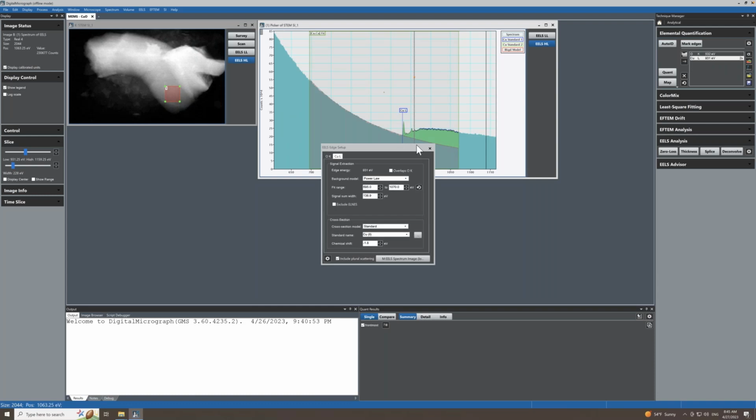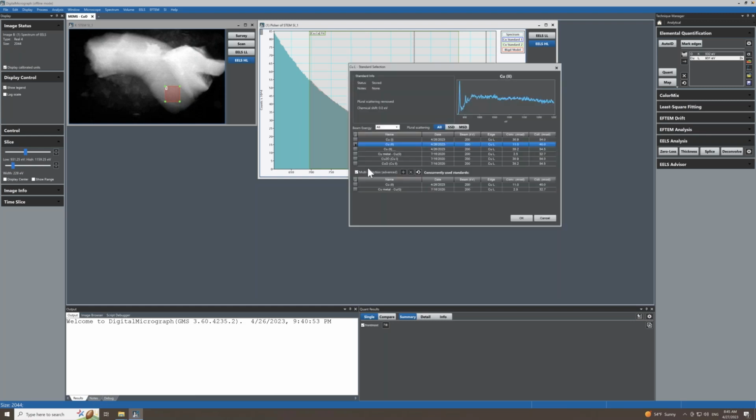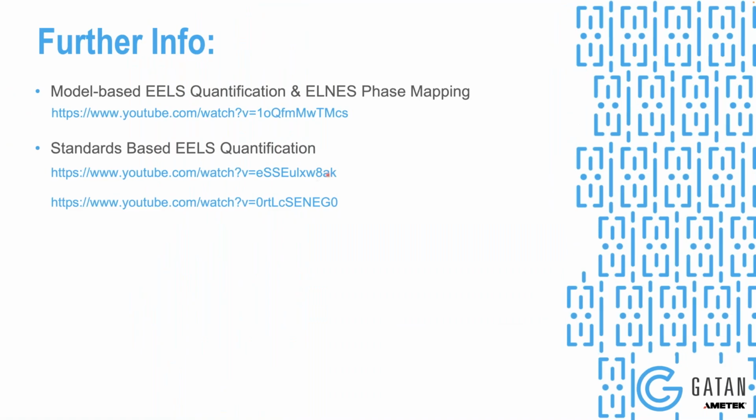For copper, I'm using a standard, but I'm using 2 standards, so you have this multi-selection way of doing that. That's done step by step in, I'm not sure which link it is, I think it's the top one, about a 10-minute walkthrough on how to import the standards from whatever you want, and then how to use them for processing or mapping.